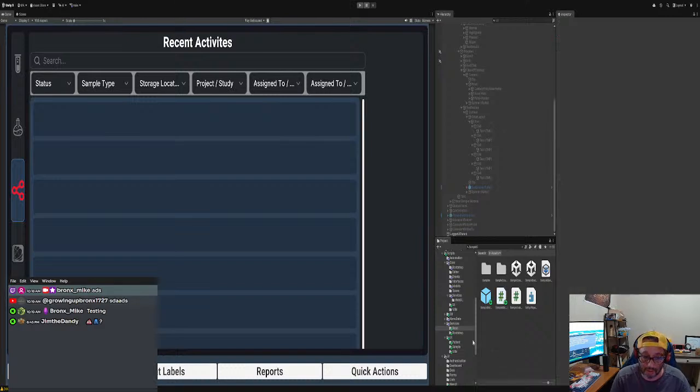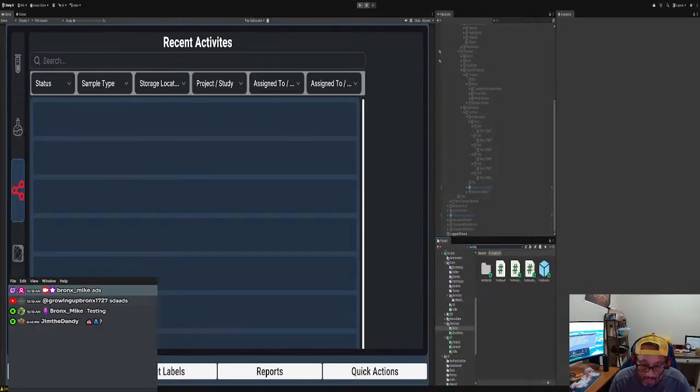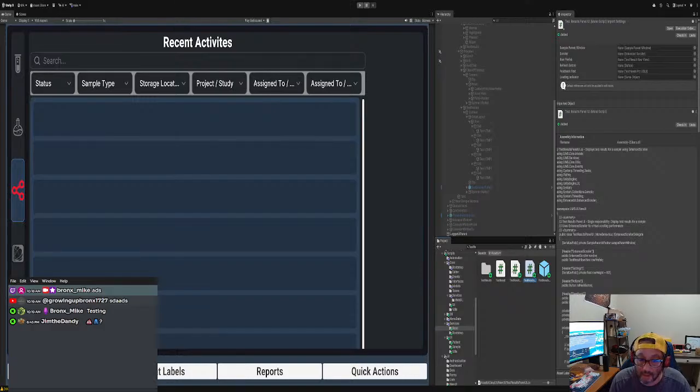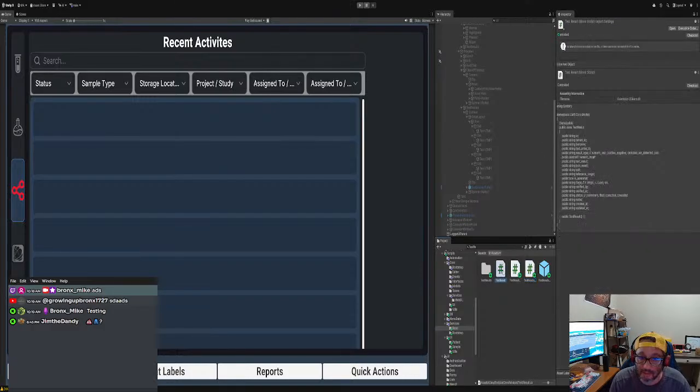Okay, and so that's what we're going to do. We're going to go to, what was it, test results. Test results, panel, test results, row, view, and then test results. Okay, and now what was it that we did? Get sample by row.